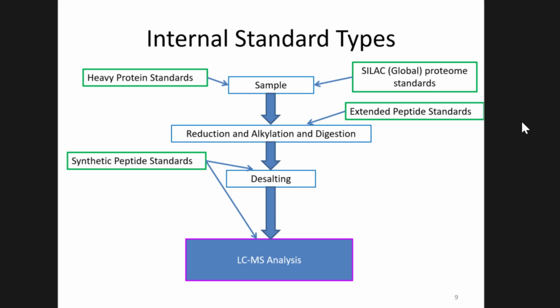If you purchase the heavy isotopically labeled versions, they will be more expensive, and you can use those as internal standards. If that's out of the price range or your budget, you can get light ones made and use those as external standards, or you can use the method of standard addition, which Andy mentioned earlier, by adding those into your matrix and seeing the change as you add them in.